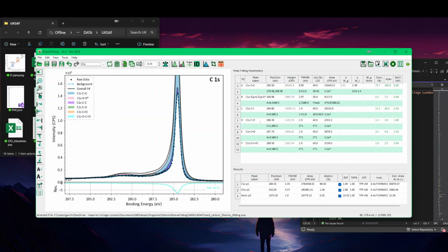So we have the O-C double bond O, which is A plus 4.5 plus minus 0.5. So this is what I'm able to give in contrast to Gaussian. And the pi-pi, or the C double bond C, is in function of the pi-pi star, or inversely, using the A times 0.072. So I first have to create a background.